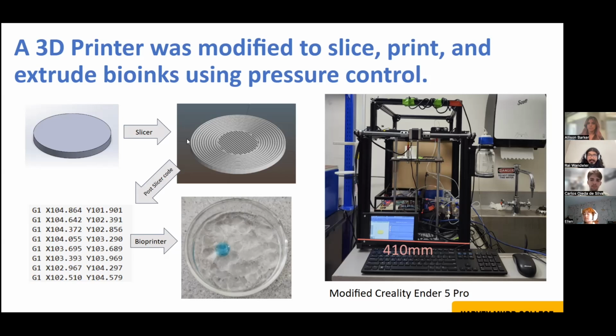Currently, we have a pressure pump system which we developed during the spring semester, which is able to control pressure based on a desired pressure we give. Basically, the system would first start with the pressure it desires to have, and then it would output the pressure. It would then check how much pressure we actually have and adjust for any difference in pressure. This is a pretty good way to control the pressure precisely.